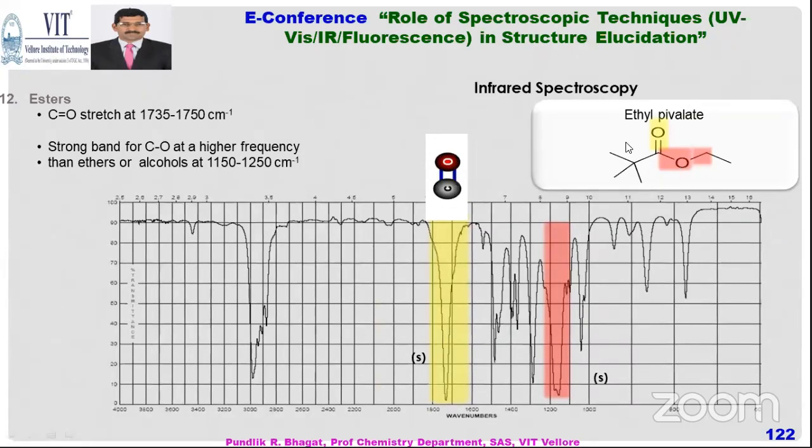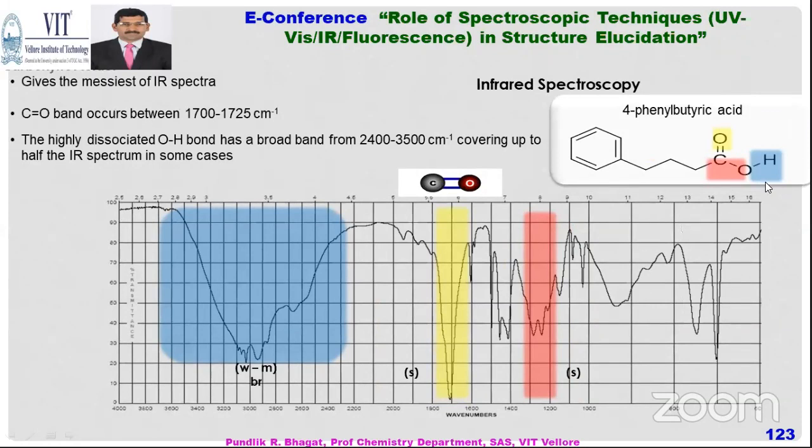Now here is a tertiary group, and this is the ester group. Of course, the ester group is above, so this CO group is present again here, and you will find the red color CO bond, which comes around 1200. This comes under the fingerprint region, and less than 3000 is again aliphatic CH. Similarly, this OH group, see, is a very broad peak.